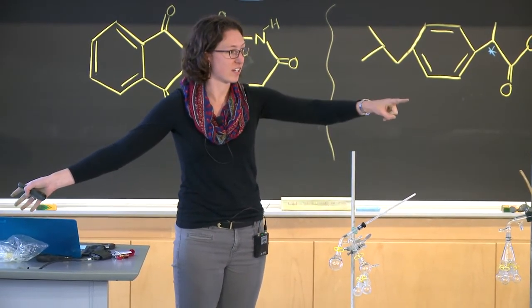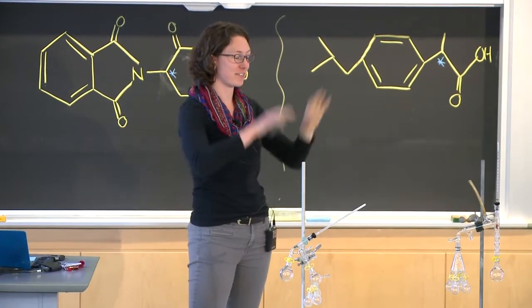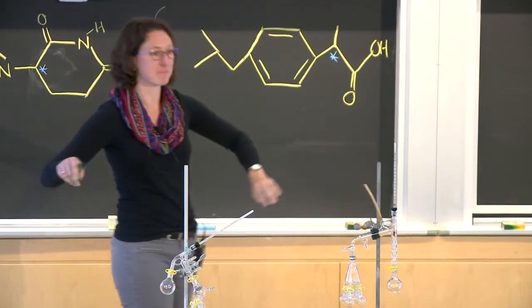Anything else? Yeah. Do we make the essential oil from the plant? No, we have already gotten it from the plant, so you don't have to do the steam distillation part. We will hand you the oil, and then you will just separate it into its components.